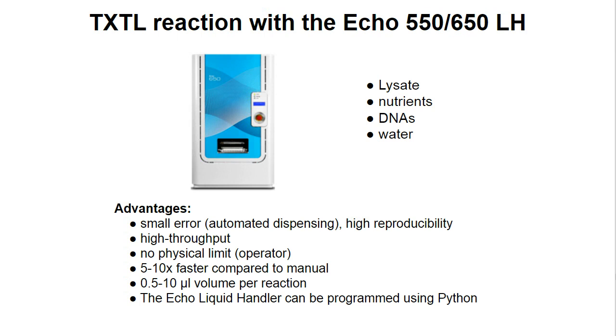And in addition to all of that, the liquid handler accepts CSV files as their instruction. And so if you want to semi-automate the design of your experiments, that can easily be done. We use Python to make the CSV files, and then we put them onto the Echo software, and it performs the reactions. But it can be done with any language that can output CSV files. So basically, any language can be used to design your reactions and make it faster.